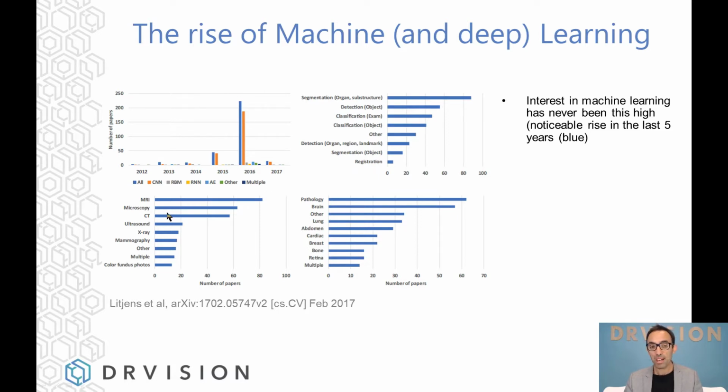The type of microscopy or the type of imaging isn't just the type of microscopy or imaging that we do. Typically, I guess a lot of you will be doing light microscopy or electron microscopy, so that would be under this category. But actually most people using this type of technology are in the clinical setting, so they are using MRIs, CTs, and so on.